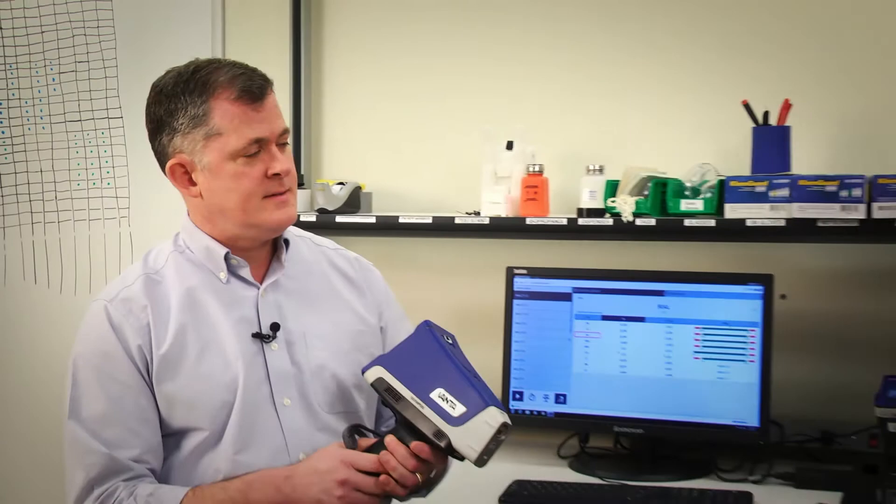Welcome to ASA Experts. I'm Ian Vincent and today I'm joined with Ted Shields and the new Vanta XRF handheld analyzer. Before we get into the new Vanta, can you tell me a little bit on how XRF is being used out in the field?